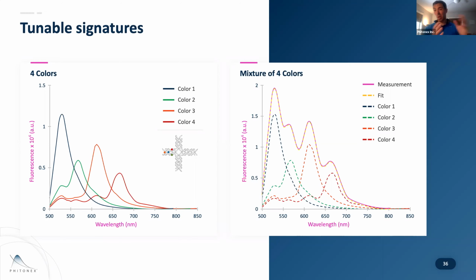That's another note here, which is just the pace of development. We're hopeful that we can get through these current times and actually get a large set of labels into researchers' hands over the next year, and show them what's possible. But this gives you a sense of the pace: 4 spectral labels, 2 weeks, and we're able to essentially design spectral labels that we know could be separated.